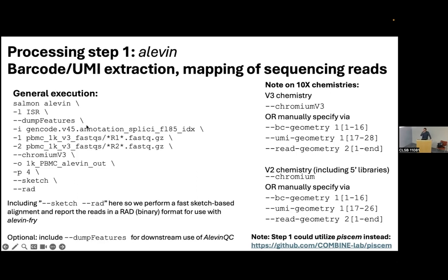It'll talk about how it decided we have X number of cells, throwing away all of the rest of the obvious debris. It'll show you a cool little elbow plot of how and where it drew that line. It's a helpful thing to just run and stash. And if you downstream encounter any issues where a sample is acting as an outlier, you can always investigate, make sure quality-wise everything looked okay upstream.